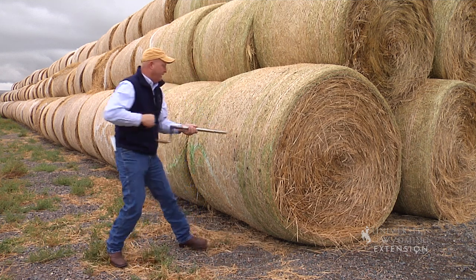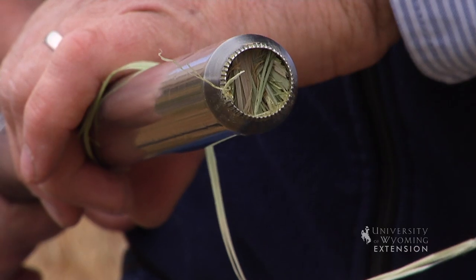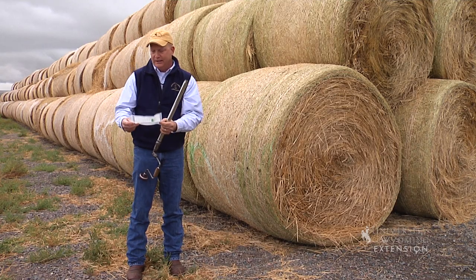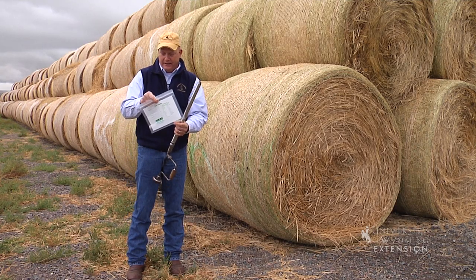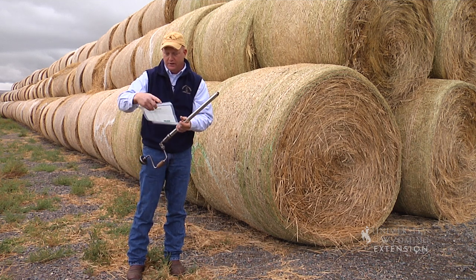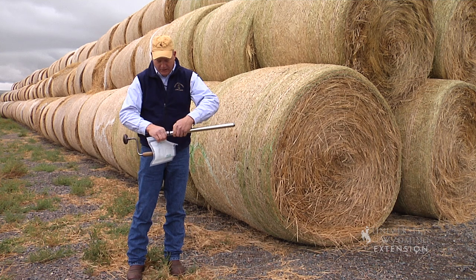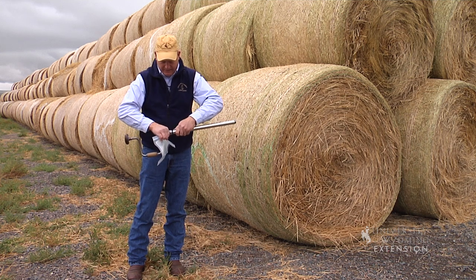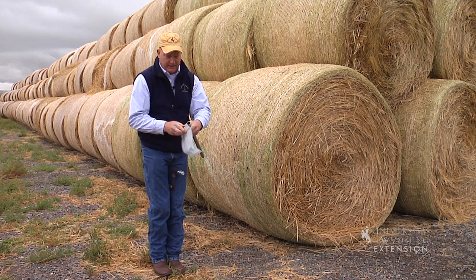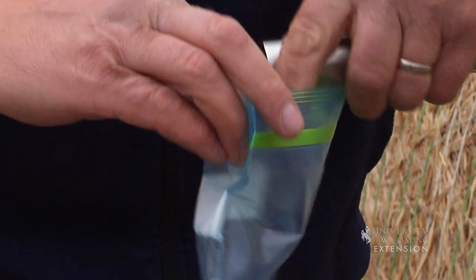Then you can remove the probe. The hollow tube in the middle collects the core sample. You can then take a simple zip lock bag — this one is from a local feed laboratory — where you can put exactly where the bale came from and what field it's associated with. You need again about ten samples per field to get an estimate.